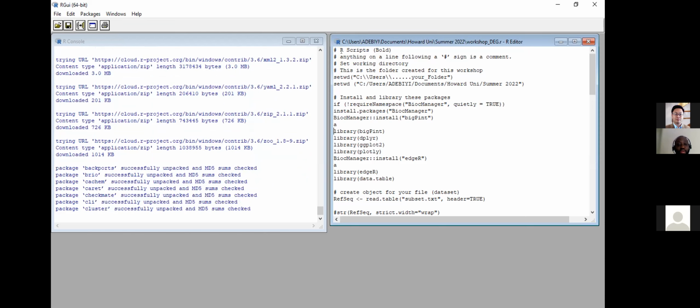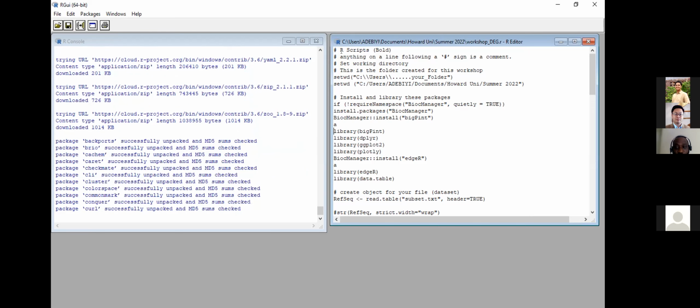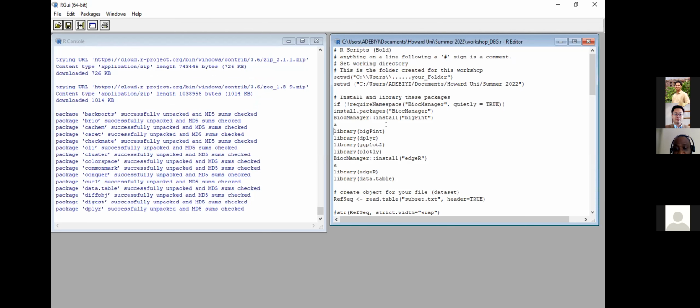Yes, please. Rashid, right? Yes, Dr. Sobitan, thank you so much for guiding us through the whole process. My question was, for now, we stop at library data.table, yes? You stop at what?